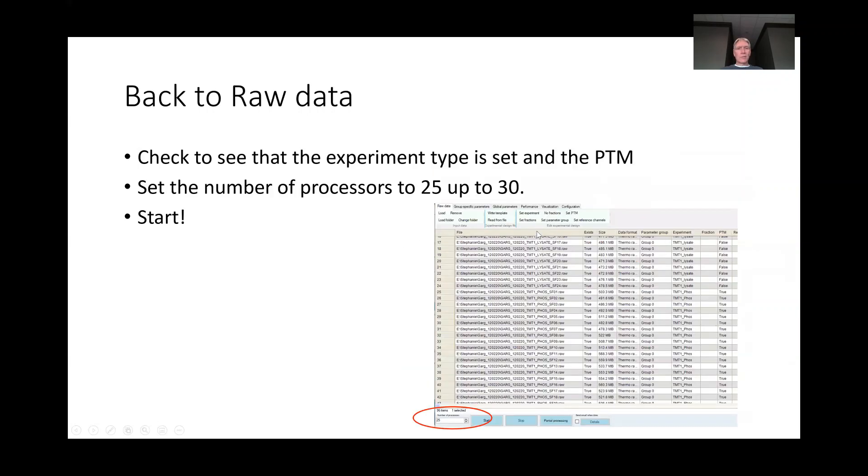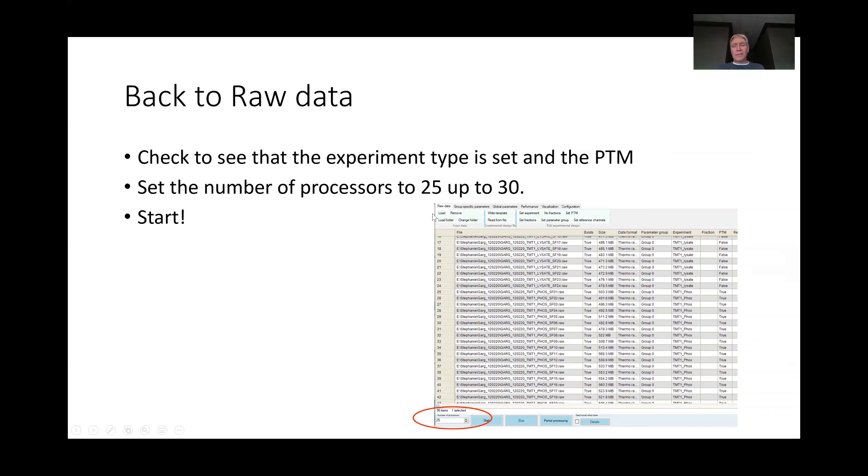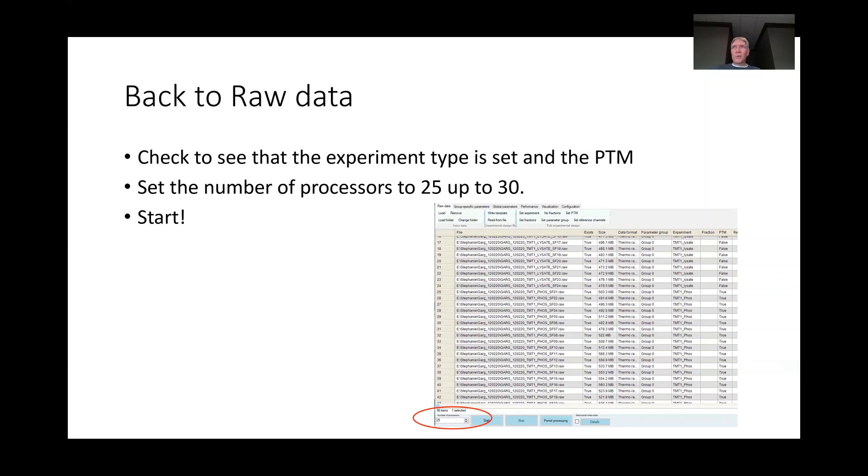And then the last thing is to set the number of processors depending on what computer that you're using. If you've got a pretty nice computer and you've got 16 processors with virtual cores, so that you've actually got 32 processors, you might want to set the processors up to 25 or 30 so it's using the majority of that processing power because it's going to take a lot. The suggestion is that you don't use every processor that you have in your computer, because anytime your computer has something running in the background, it could lock it up.